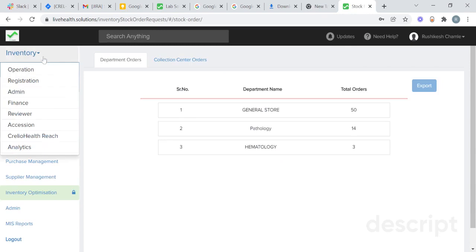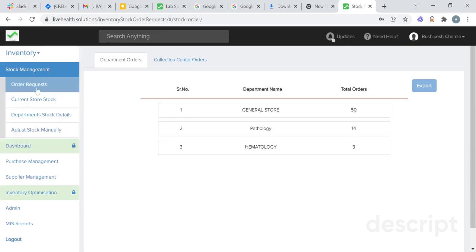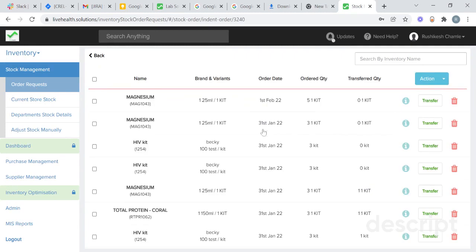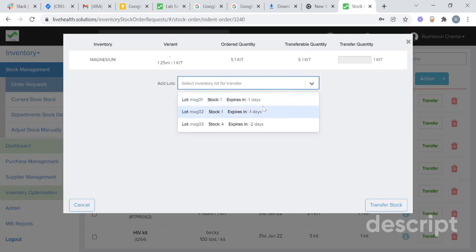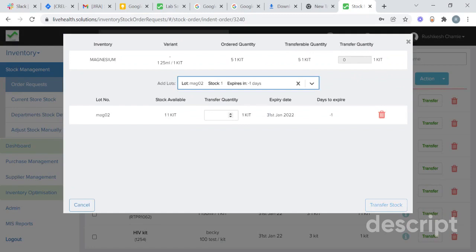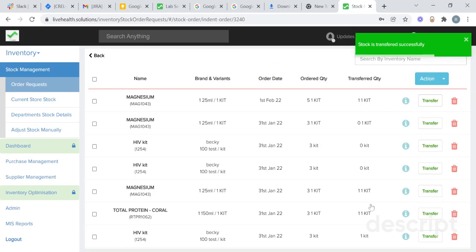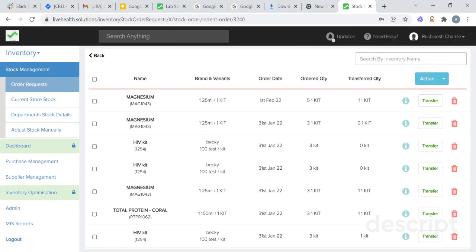At store level, they transfer that stock to the particular department. To transfer the stock, go to the inventory section, go to stock management, go to order request, and go to department order. We have received a request from the pathology department. Click on the pathology department — we have received an order for magnesium. To transfer the stock, click on transfer, select the lot you want to transfer, add the transfer quantity — suppose I want to transfer one quantity — and click on transfer stock. The stock has been transferred from store to department.